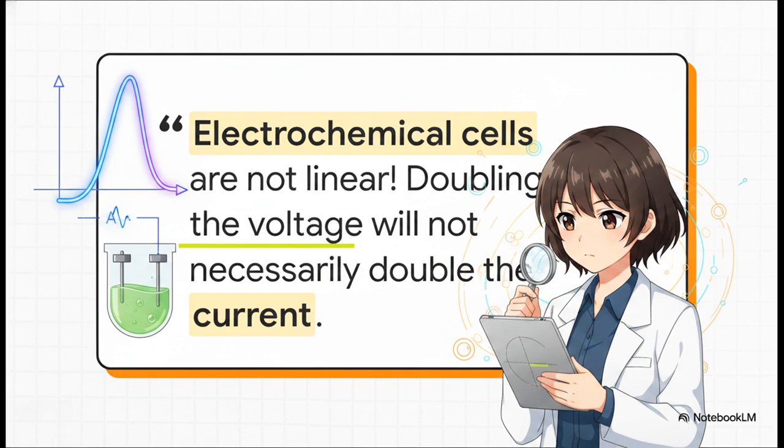By looking at a small portion of the curve, it acts in a pseudo-linear way, and that's what allows us to properly analyze the data without distorting the whole system.